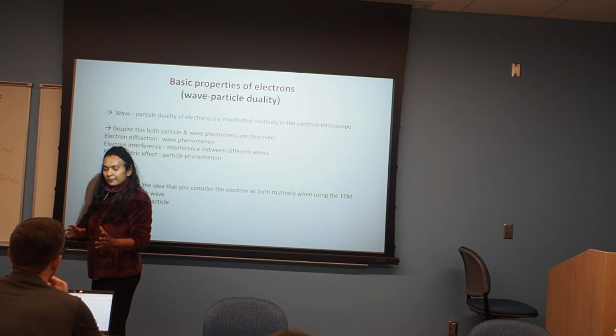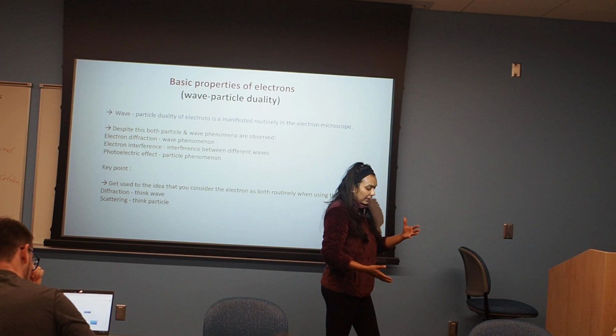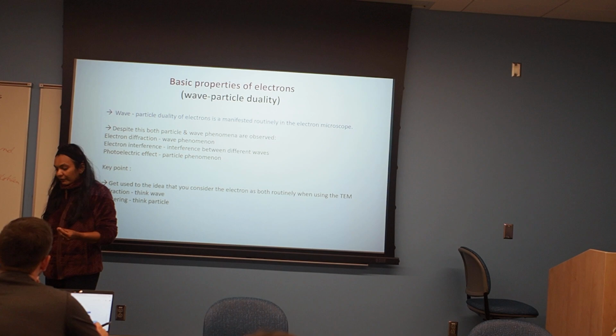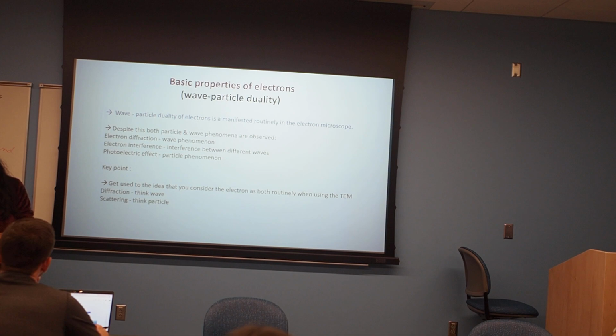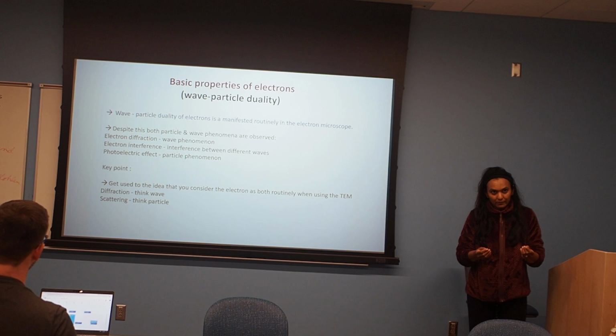Generally, all the microscopes that we have here at Oak Ridge National Lab and at UT, they all go from 100 kV to 300 kV. That's a common range. Now, in these microscopes, when you have a lower energy of electrons versus higher energy of electrons, how is it changing? In the high energy, some relativistic character. Relativistic behavior is associated with a higher energy of electrons, right?